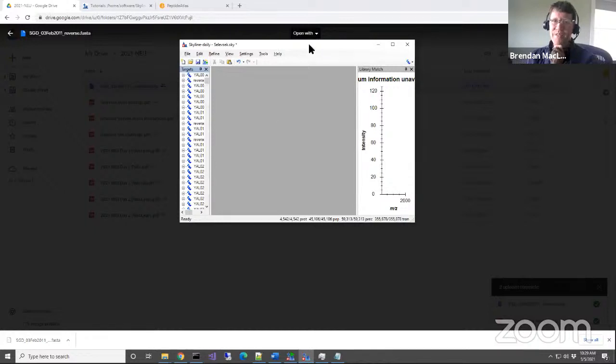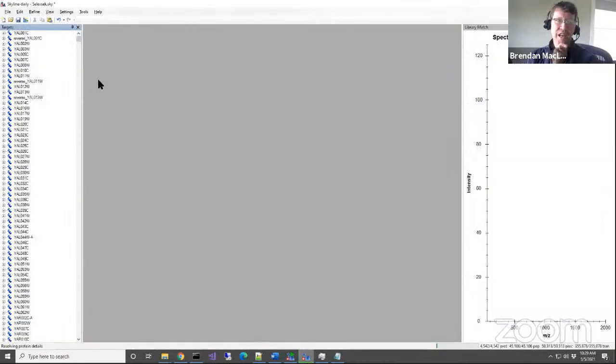So now we have this large list. You can already see some things that are included in this that say reverse underscore. Those are the decoys. Those are false discoveries, essentially. But we don't have an IRT model yet, so we've got to keep going here.